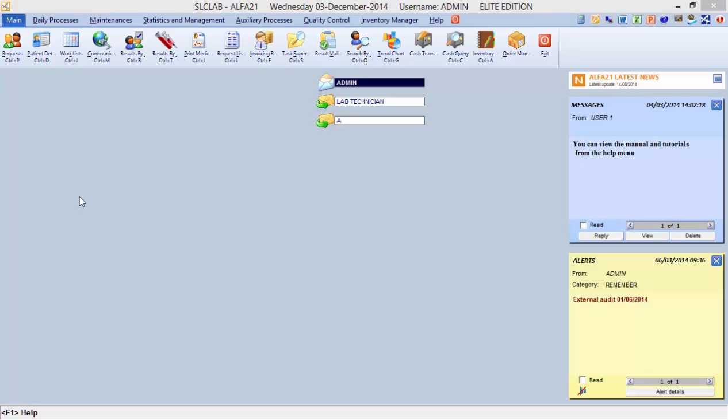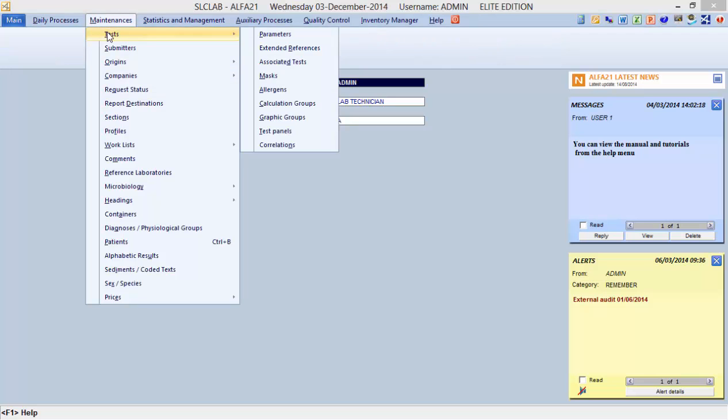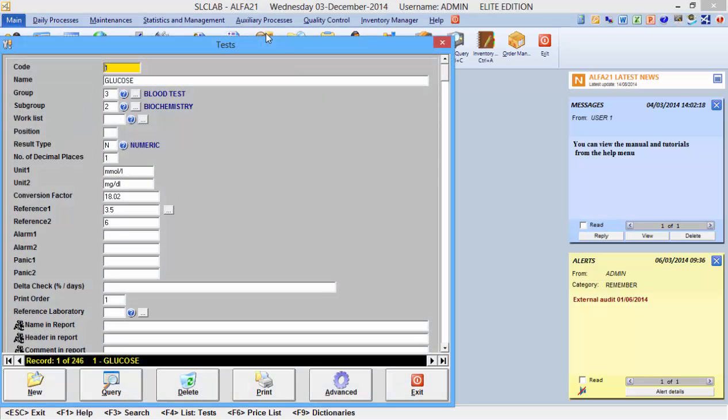In this video, we will learn how to register a new numeric test. To do this, we go to Maintenances, Tests, Parameters. We can also access this window from the Request and Results window. We can observe that there are 246 tests registered, and we are located in the first.